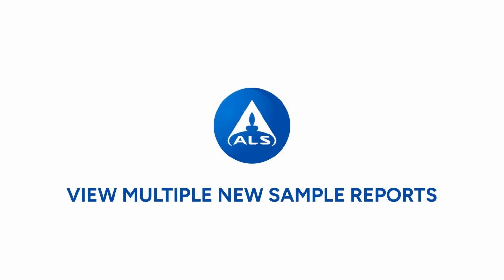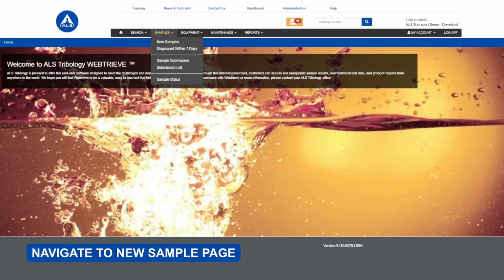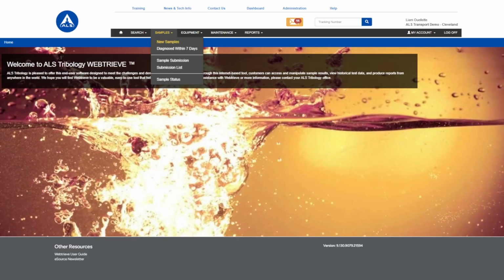In this video, I'm going to show you how to view multiple reports for new samples on desktop. Starting from the home page, you can look up at the top level navigation under the sample item. Hovering over samples will create a drop-down menu, and you can either select new samples or diagnosed within 7 days. Let's click on the new samples item.